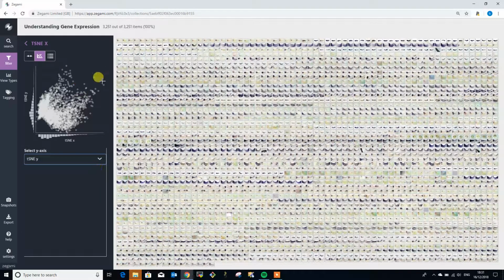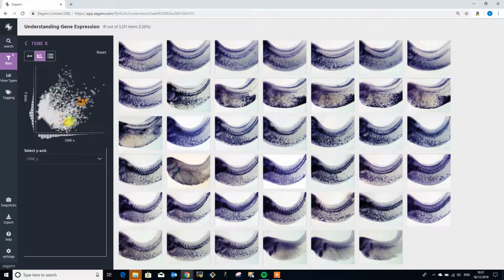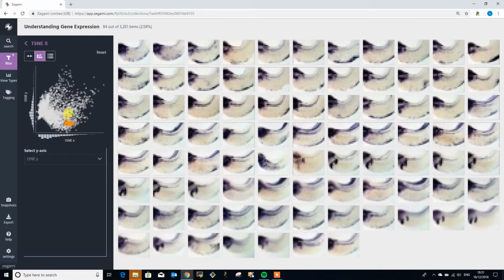and we can compare it, say, to the first component of the t-SNE versus the second component. And what this allows us to do is then this groups together really nicely different classes of images. This is without doing any particular sort of training. You can see these are all kind of coming up.